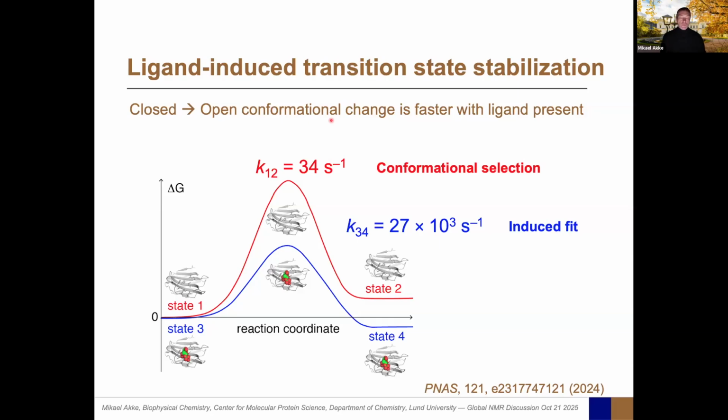But I think in many respects, we were quite lucky. NMR is very good at screening for binding when you have fast exchange or intermediate exchange. Depending on the chemical shift difference, some residues here are more slow than others and so on. So we're in the intermediate to slow regime in this case.